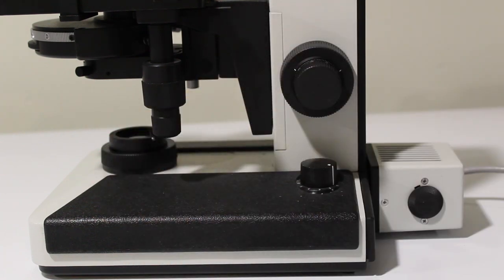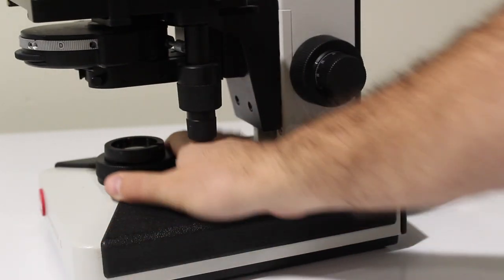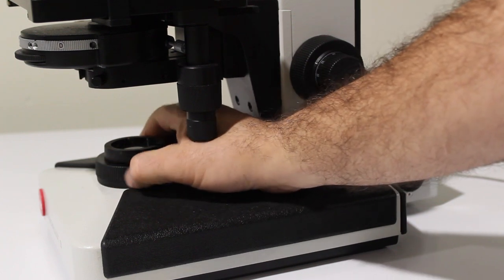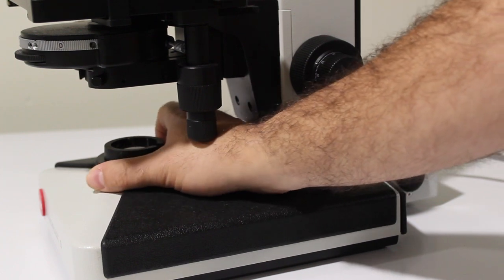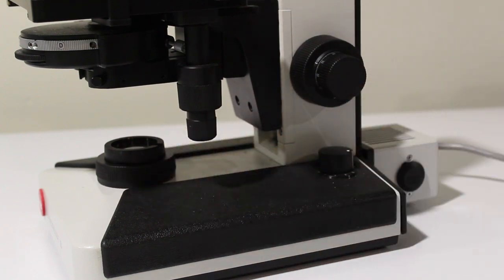Now, whether you have a bulb type or an LED type, ideally you want to try and find a microscope which has an adjustable diaphragm here on that light source. That's really important for getting good quality images out of your microscope.